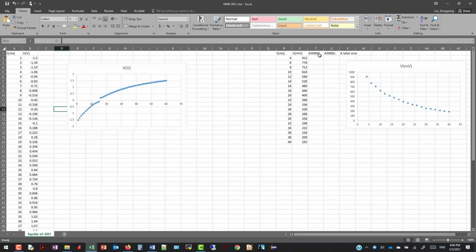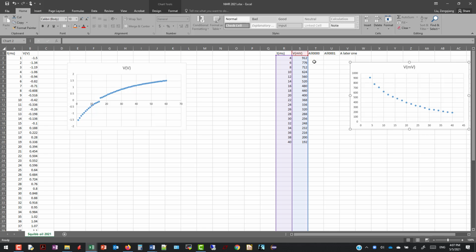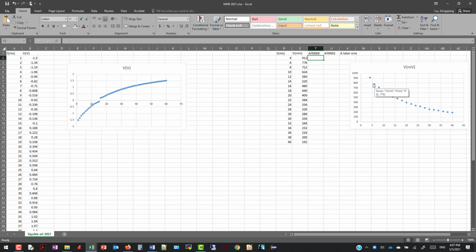Here I have a couple different columns because I did some saving of the screenshots, but I realized I probably was better off just picking the peaks from the screen. I described that in one of the videos of my experiments. I didn't really go into the data sets to extract the maxima, which will take some time.